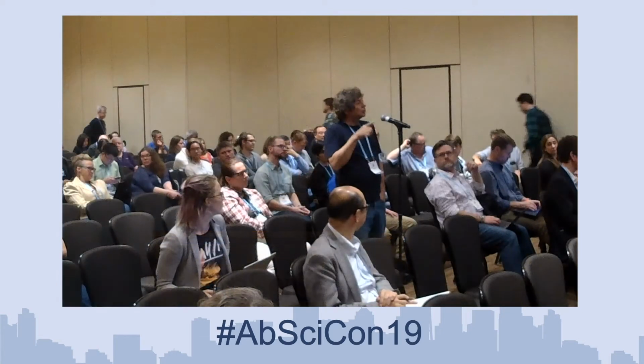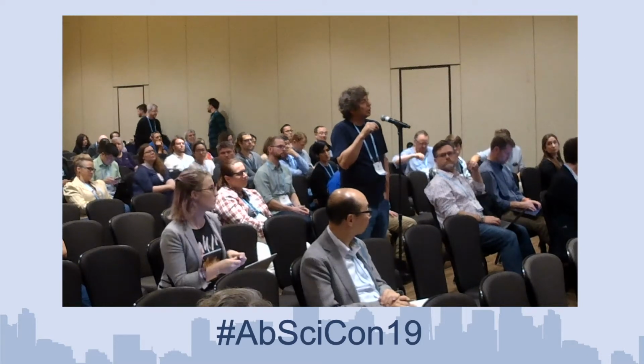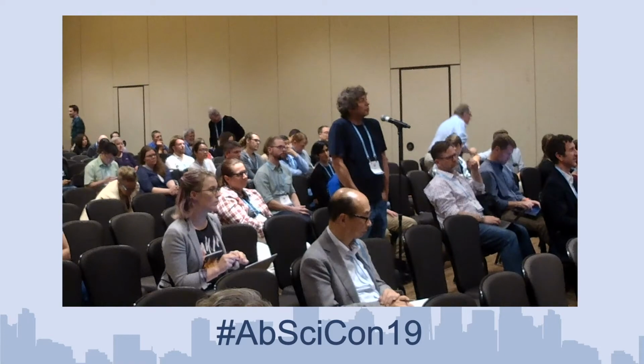Given that you're looking at very tiny scales with AFM, how do you deal with searching for things that are extremely low concentration, that you're likely to see 100 per milliliter or something like that, so you have to search through a big haystack for?